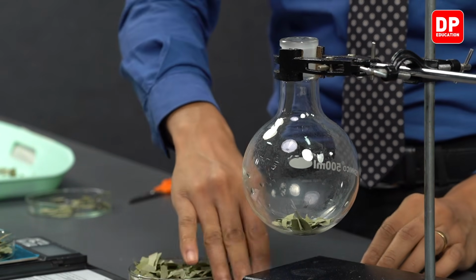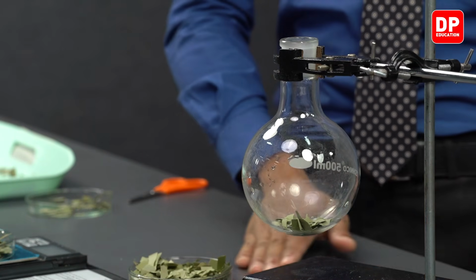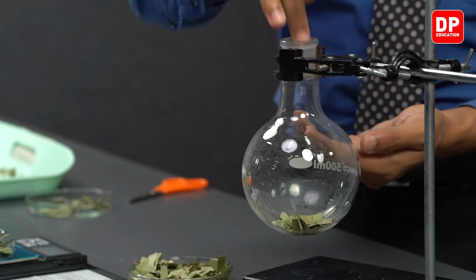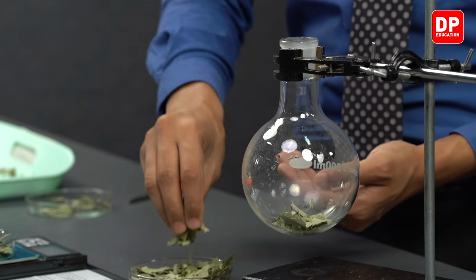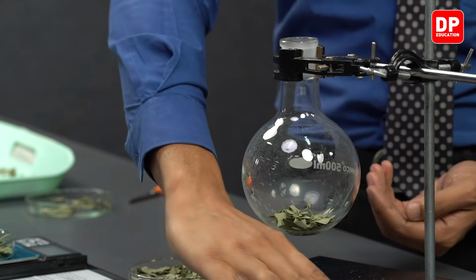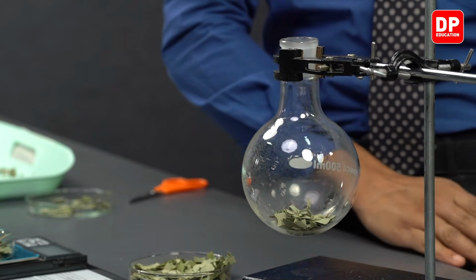Whatever cinnamon leaves get dropped out of the flask, collect them, and you can insert them back into our round bottom flask. Like so. And after inserting all of these cinnamon leaves, we can continue to add water.